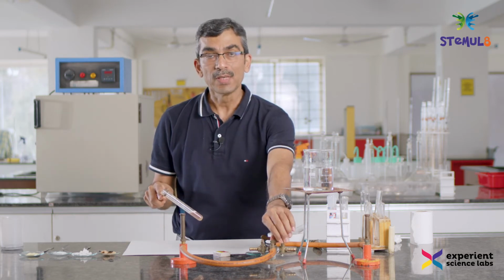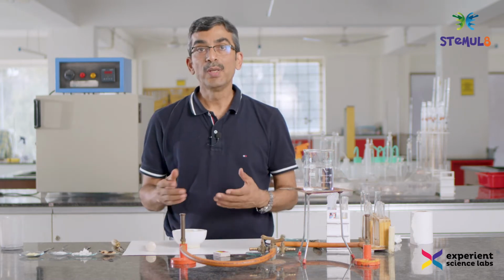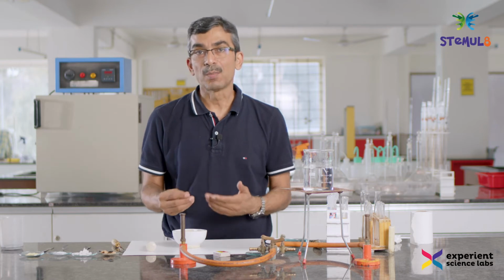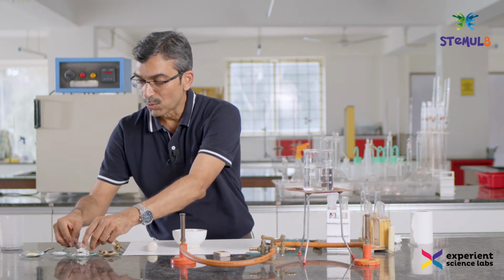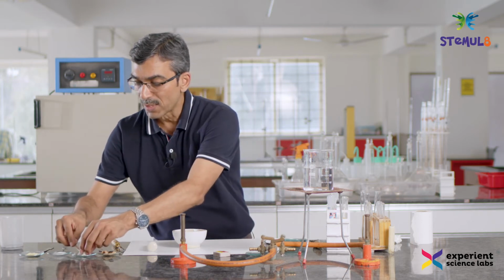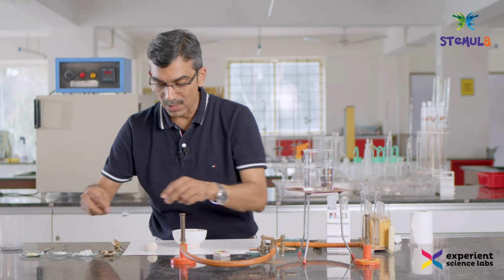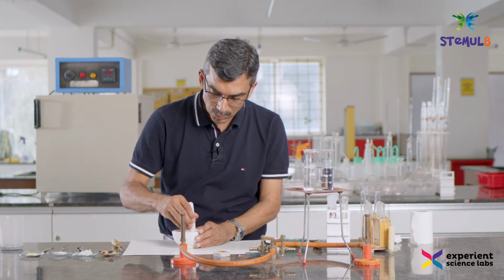Now let's do the same test for rice. For doing this test for rice, I would like to smash it up a bit rather than leaving it unsmashed, because I want it to interact well with the biuret reagent, so that it does not leave any doubt in our mind whether it has protein or it doesn't. So this is boiled rice already.